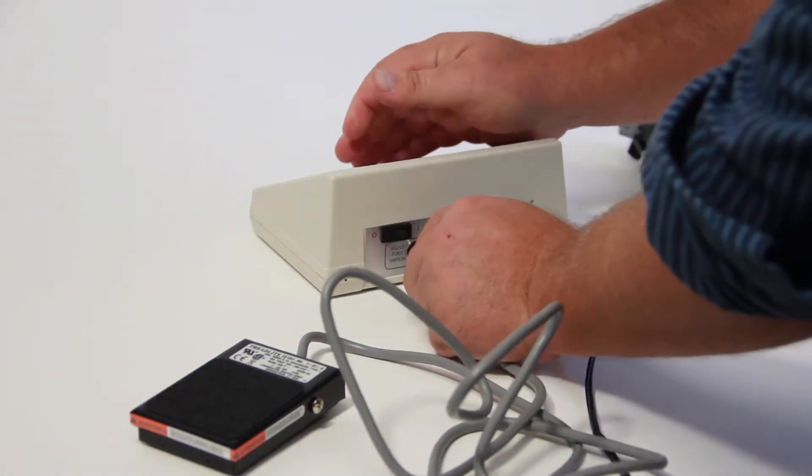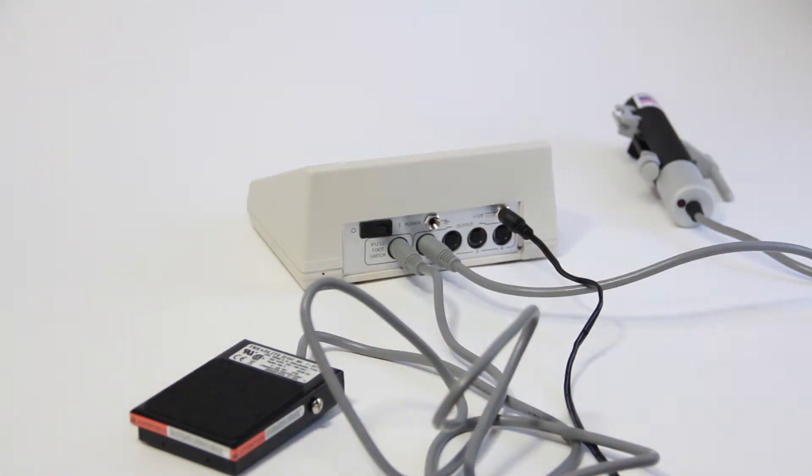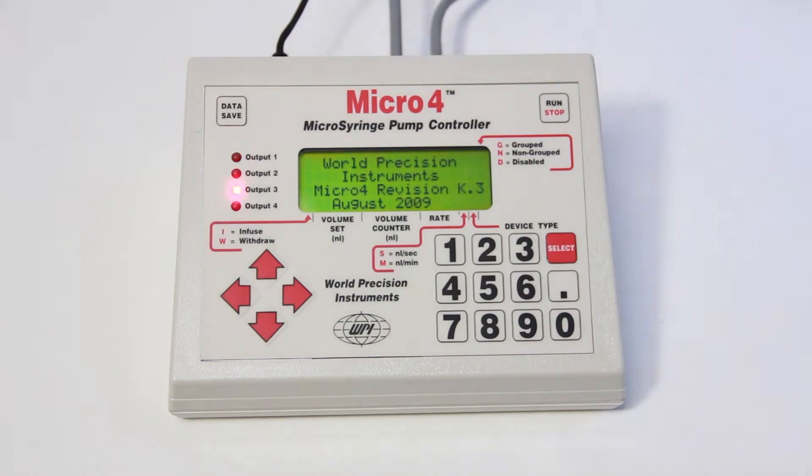An optional foot switch may be plugged into the RS232 port on the rear panel of the Micro Four controller. Finally, switch the Micro Four on using the power switch on the rear of the controller and verify that the LCD is illuminated.